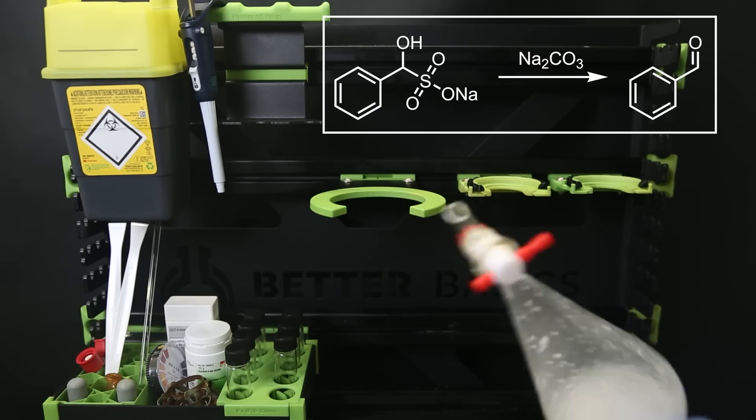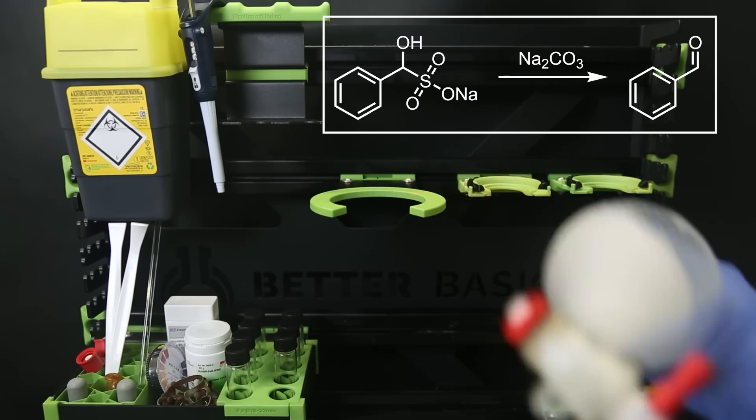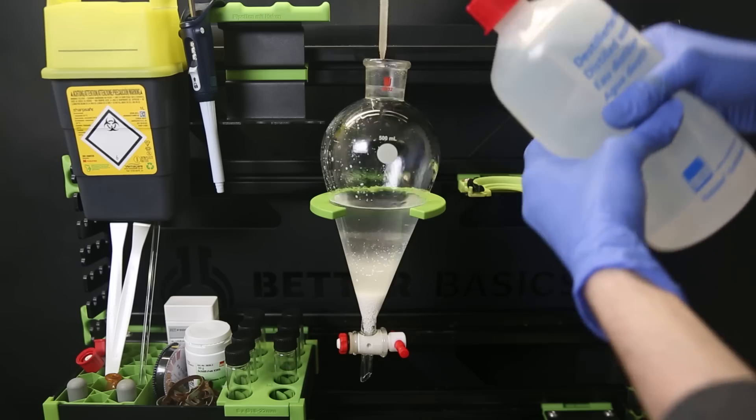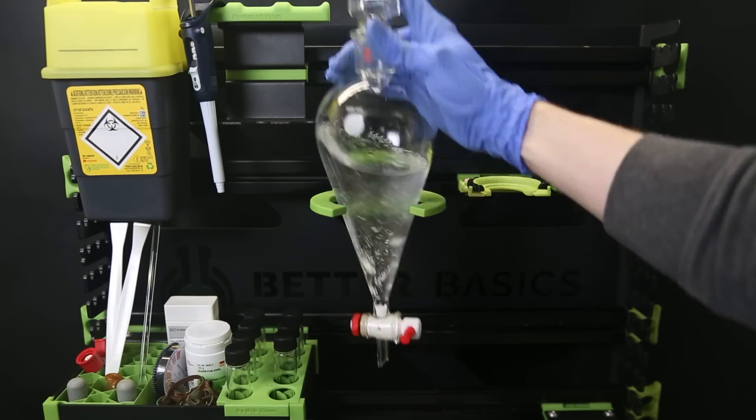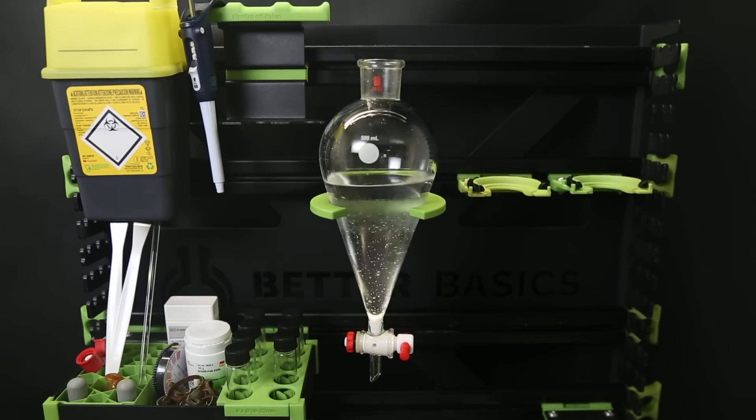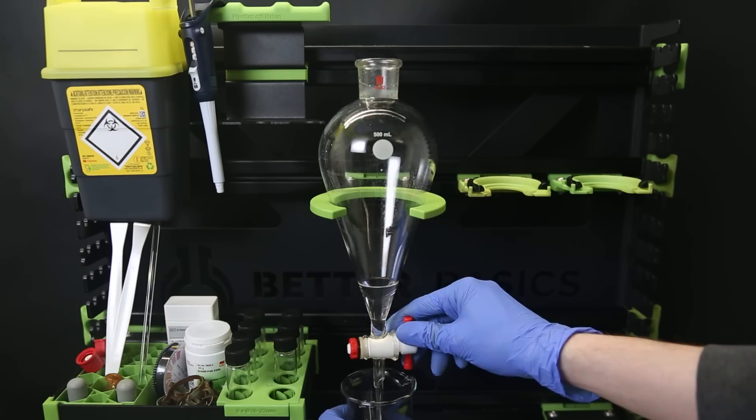What happens is that the base reacts with the bisulfite adduct to return the benzaldehyde. The sodium carbonate made it clog, so I add some water to loosen it. I then separate the layers and extract the water layer one more time with more ether.